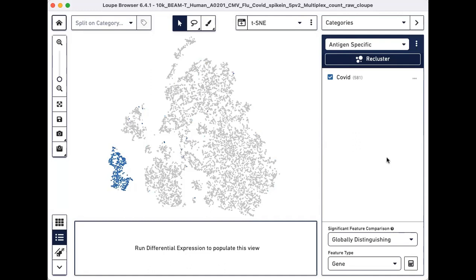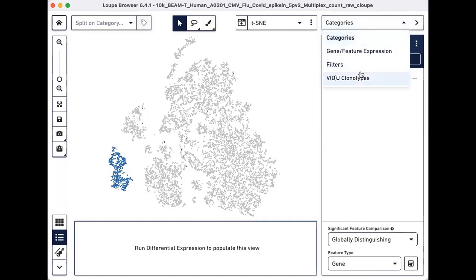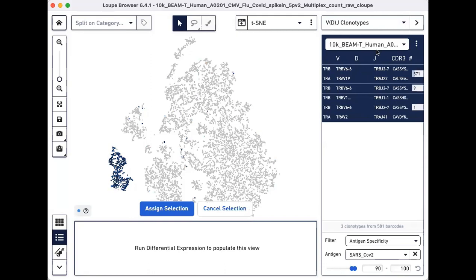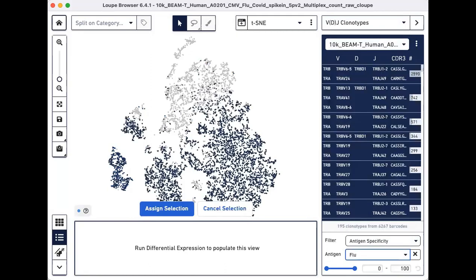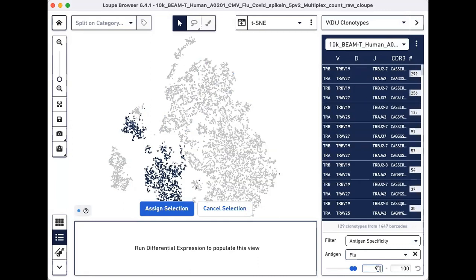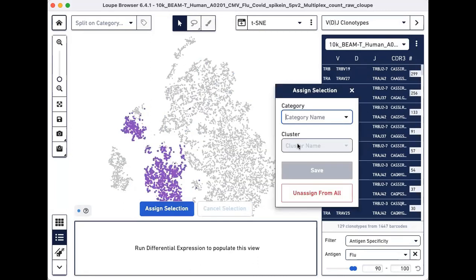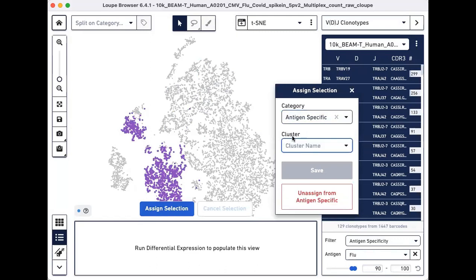Repeat these steps to find flu specific cells.